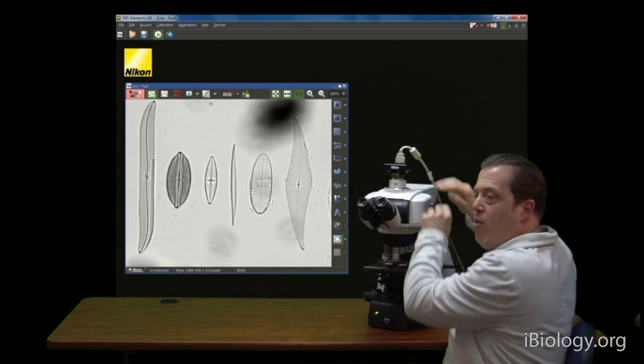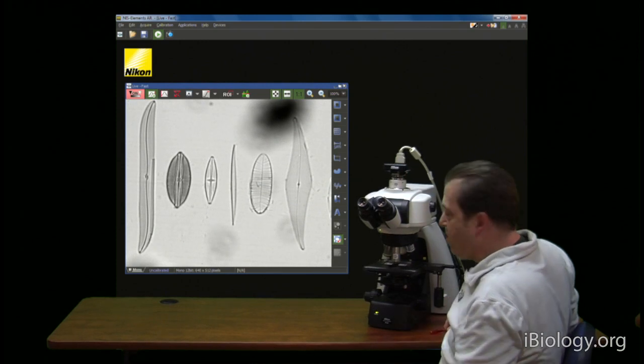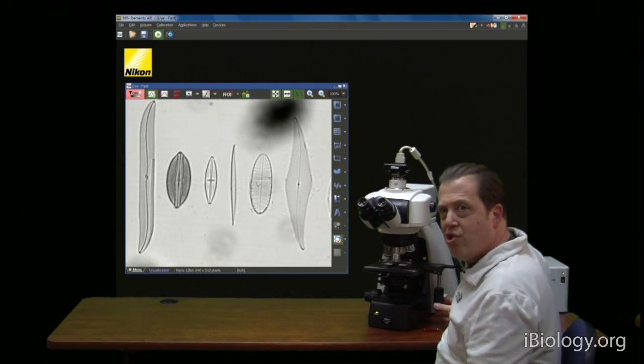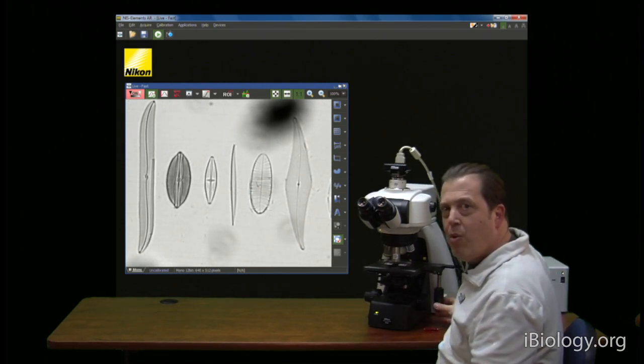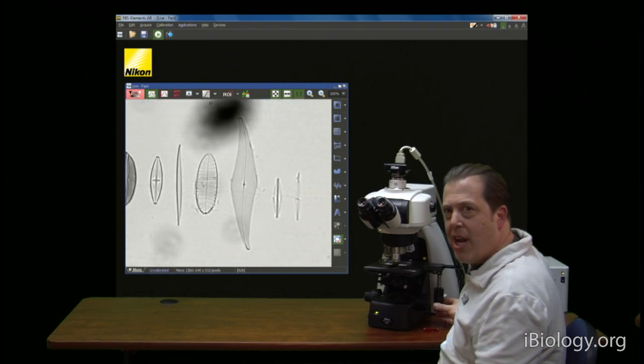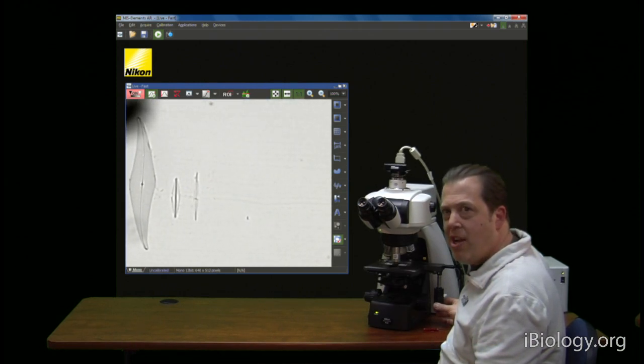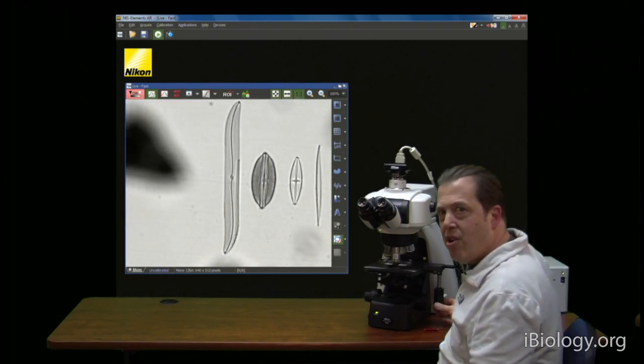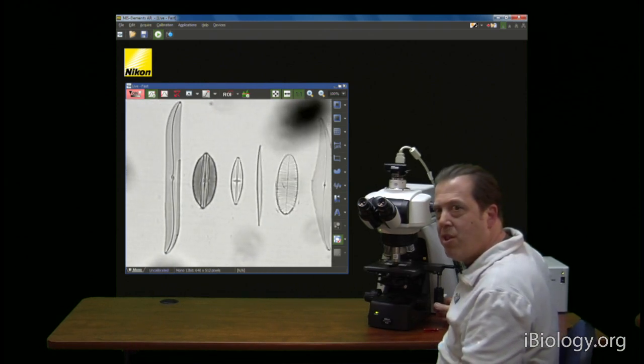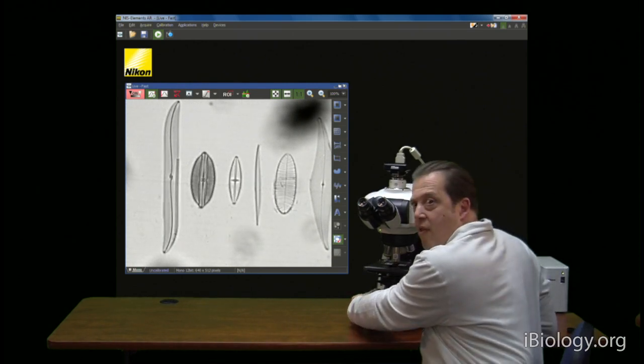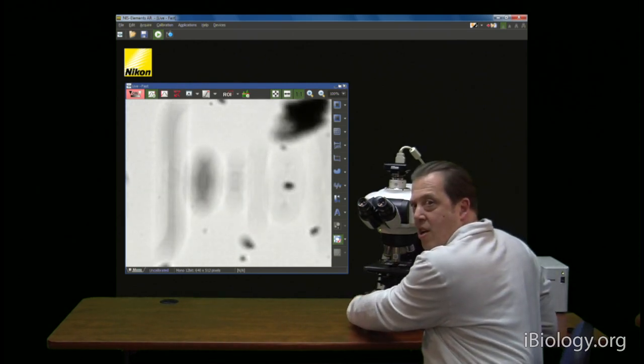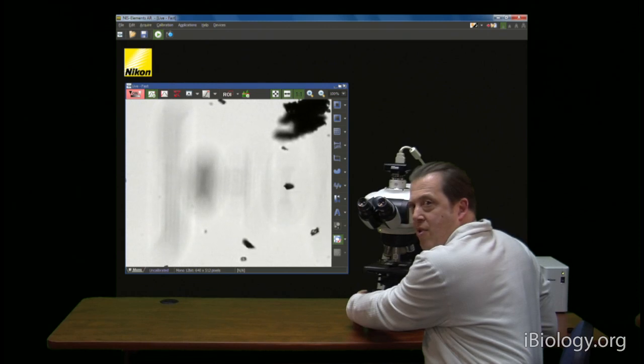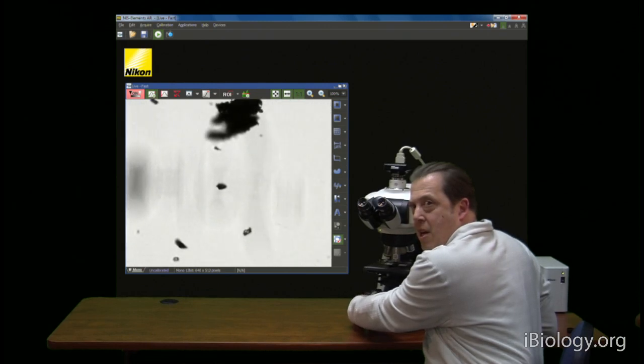And now we still see that there's some dirt there. So chances are that's on the slide. And how would we know that? Well, if we move the chamber in the slide, you can see that that dirt actually moves with the slide. We can focus up because generally if it's on the cover slip, it's going to be above the specimen.